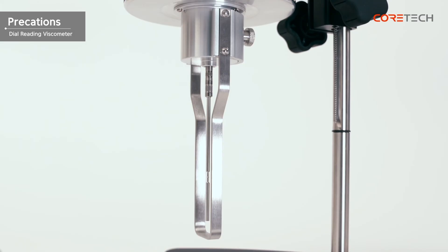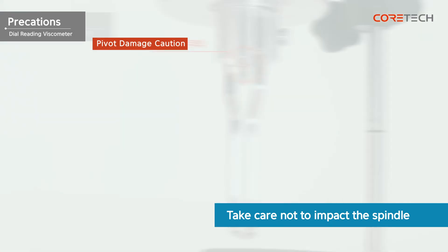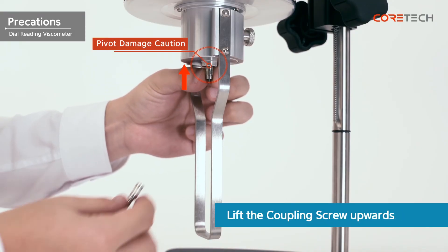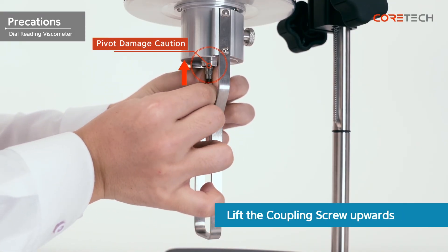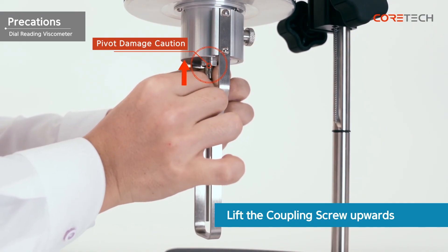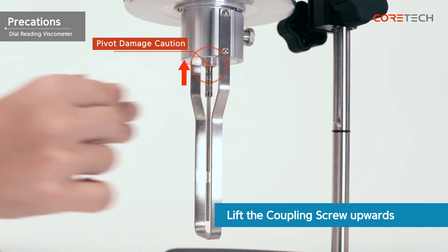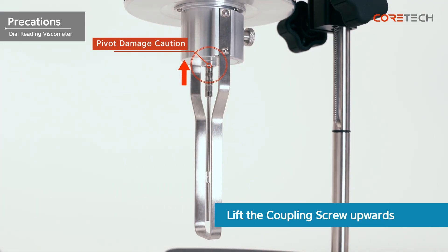Be careful not to shock the spindle while it is engaged. If the spindle is impacted, the pivot is more likely to be damaged. When combining or removing the spindle, the coupling screw must be held upwards to prevent damage to the pivot. If the pivot is damaged, contact the place of purchase or CoreTech Korea's service center. In the case of pivot damage, even if there is a free repair period, it will not be repaired for free.